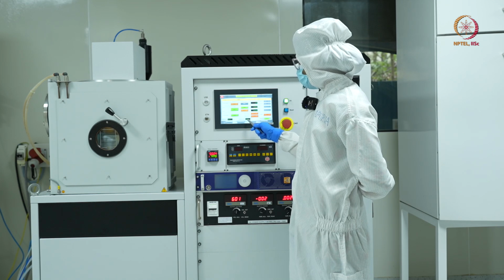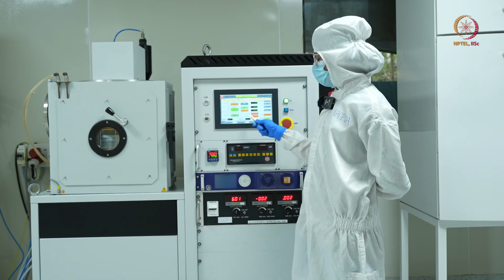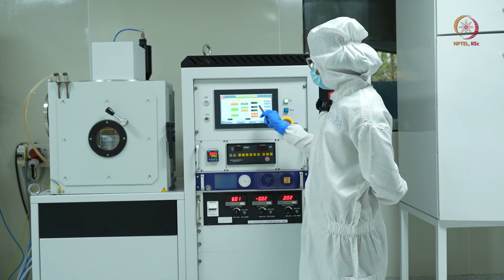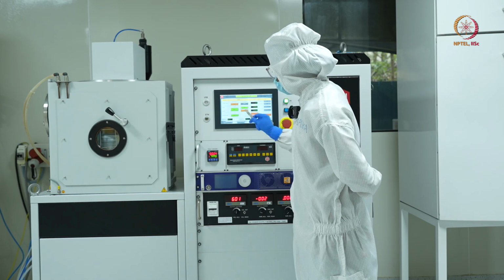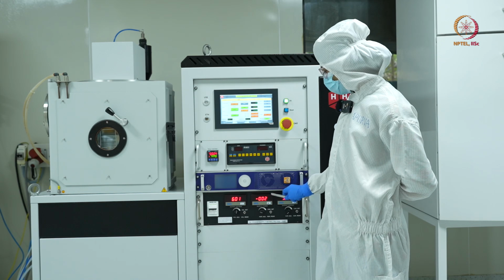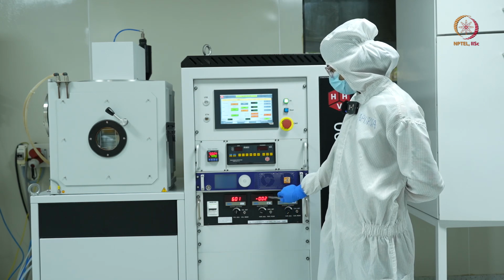At the same time, I'll monitor the sputtering pressure because this plays a major role in the deposition. Now I'll increase my flow to 8 SCCM. One thing I want you all to notice now is that the read power is 0.